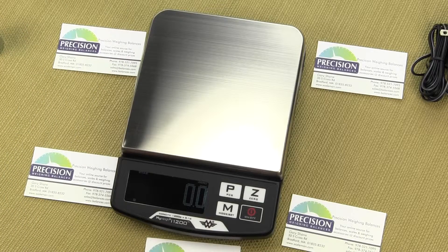So this is the i1200. There is also an i500, which is very similar except it's 500 grams by a tenth of a gram. This model is 1200 grams by a tenth of a gram.